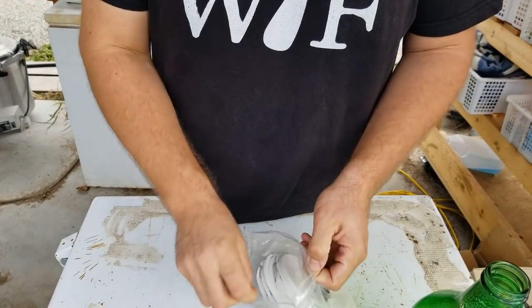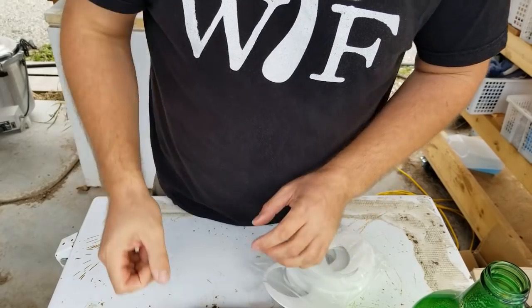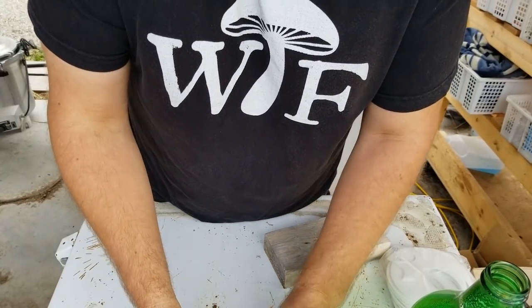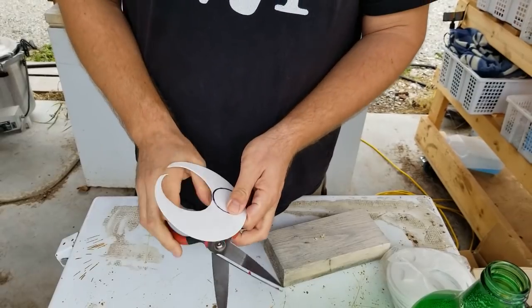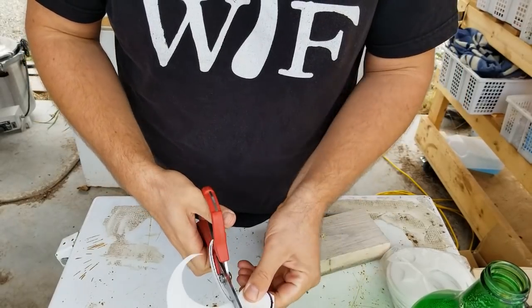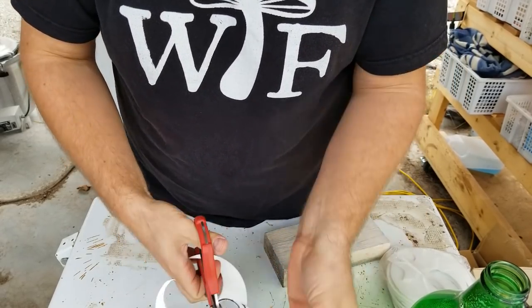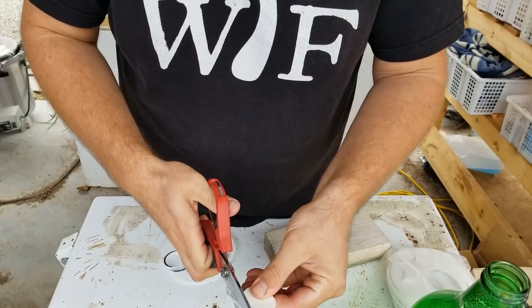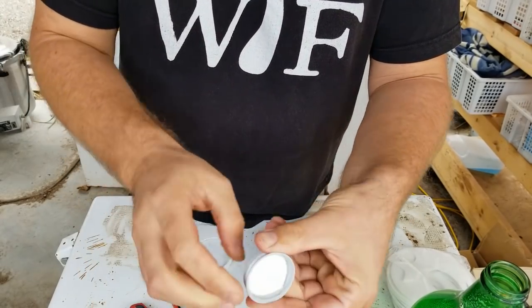You can pick up these filter discs at Fungi Perfecti. These are really great synthetic filter discs — they've literally lasted seven years since I started. I haven't bought new ones in a long time. I'm just going to trace these out and cut a filter patch to fit into this bottle. It might take a couple of tries to get the perfect fit. Yeah, that's perfect.